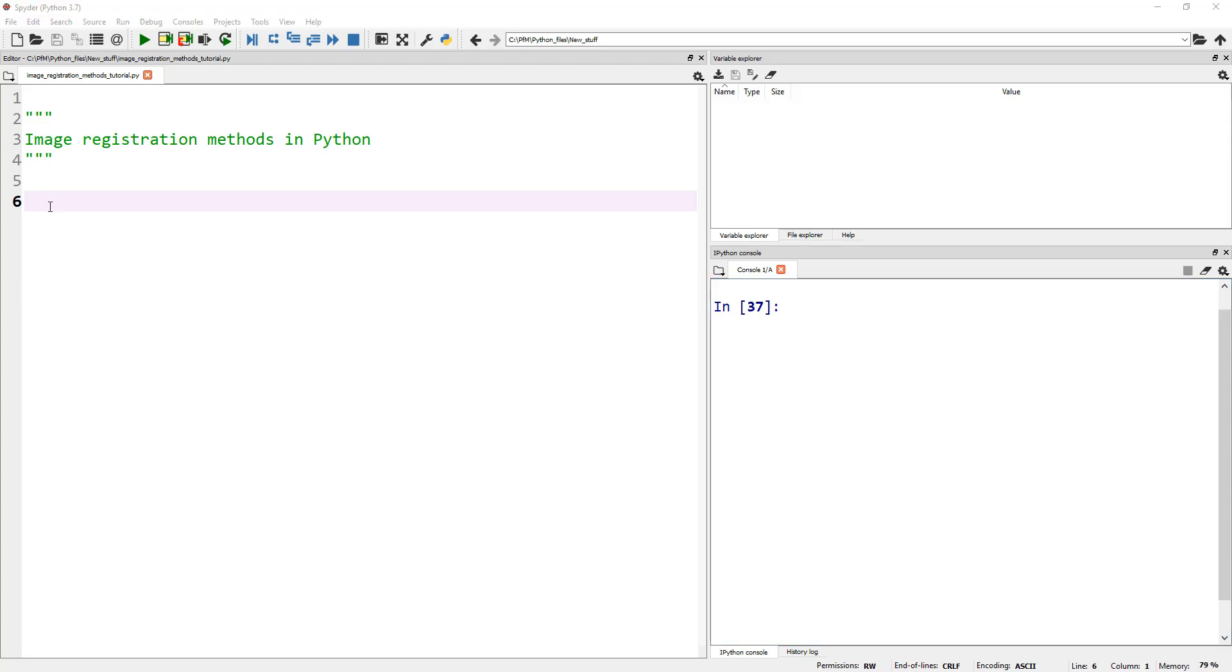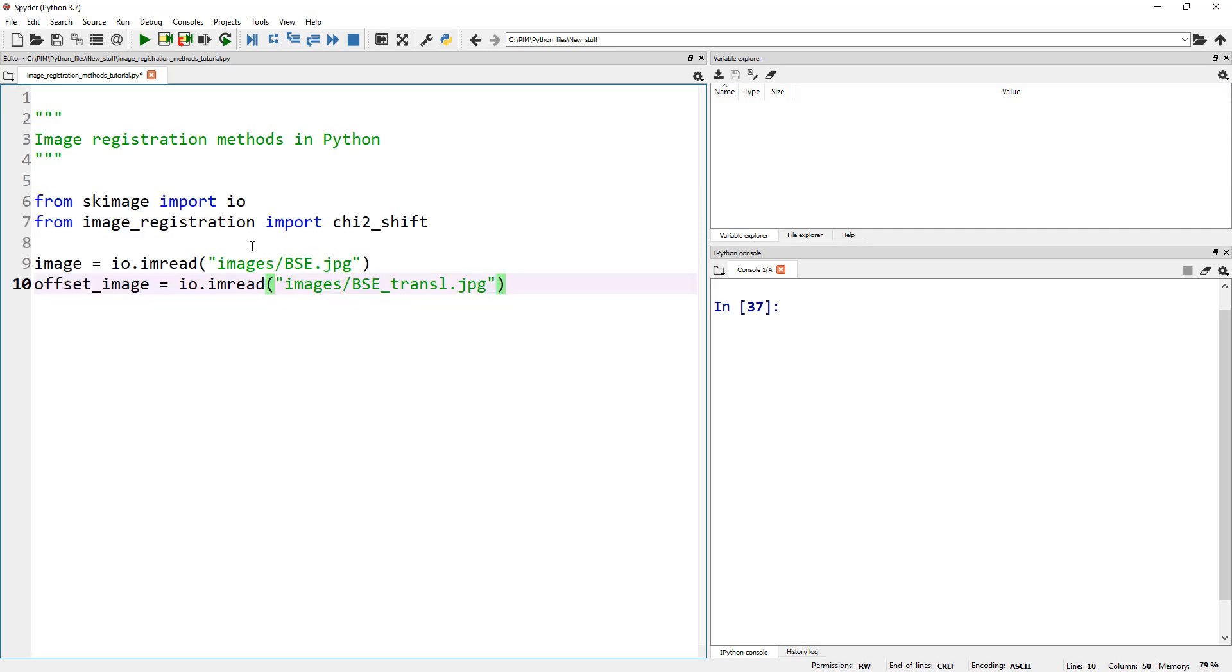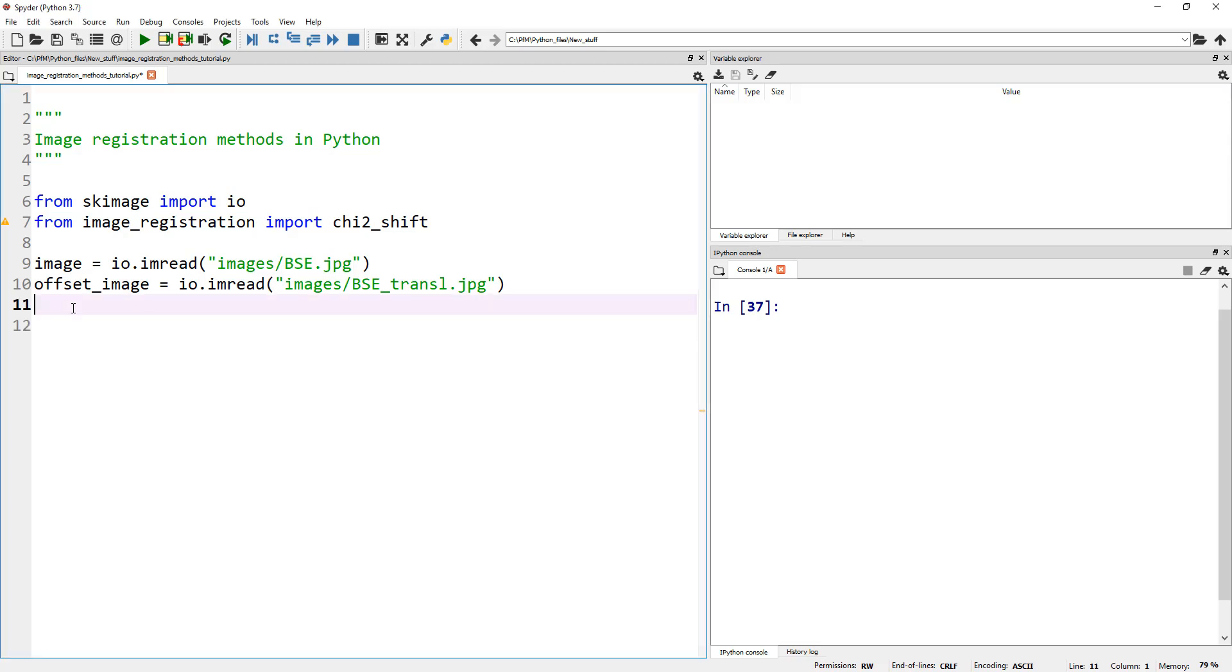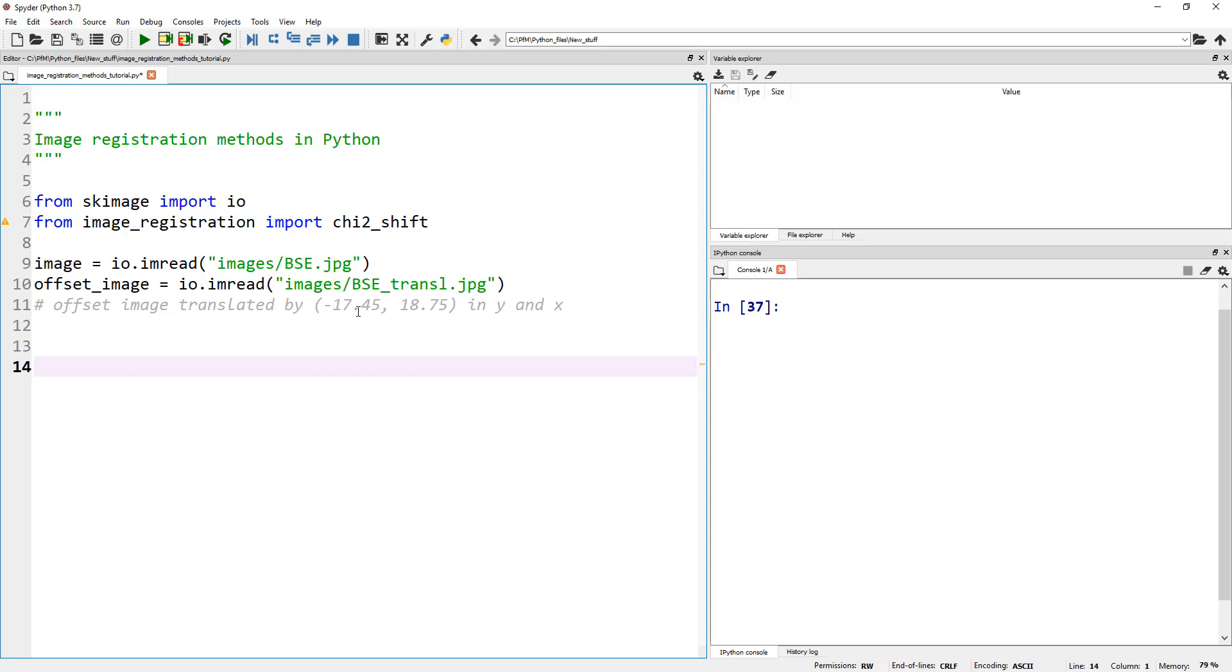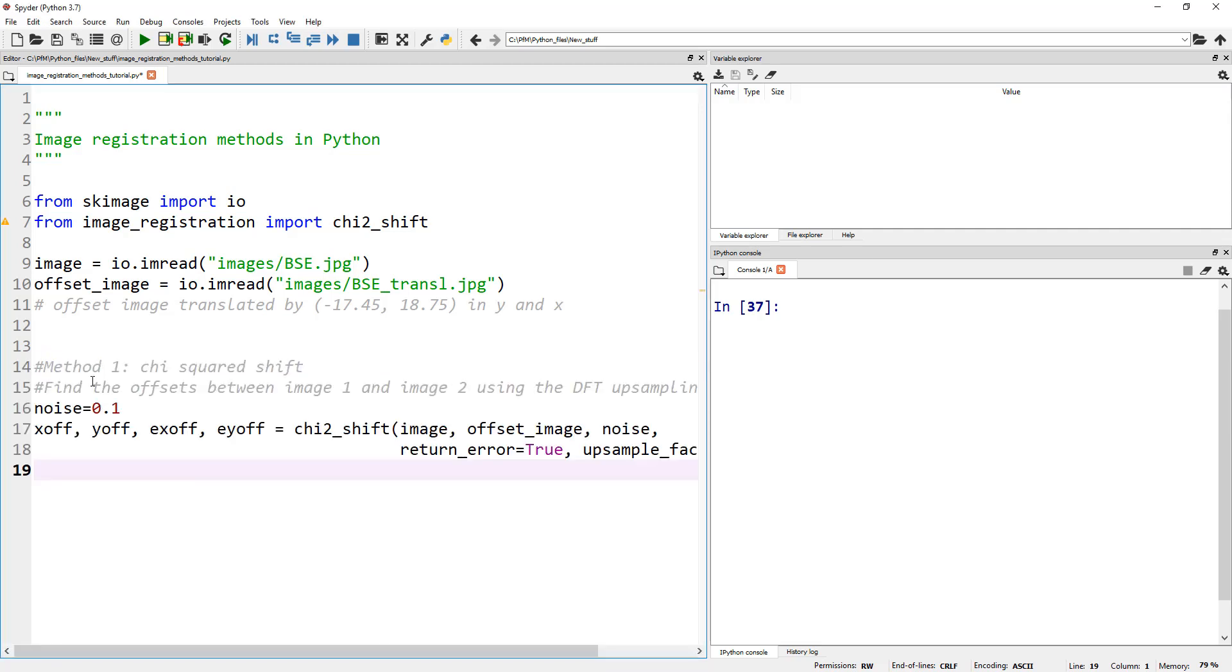But first we need to read the images. Let me copy these lines to read the images. I'm using the same image I've used in my previous tutorial. I have one image and I manually translated that image. Let's copy this commented line that tells us by how much I manually translated this second image by 17.45 pixels.